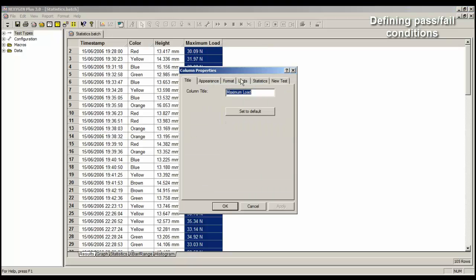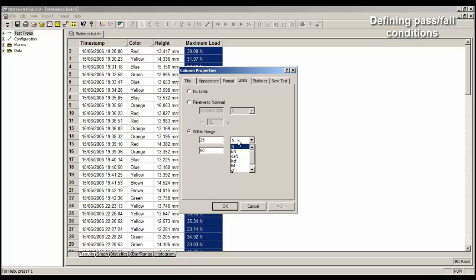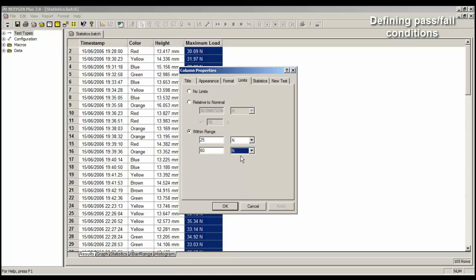We will now select Limits, and then select Within Range. Now I want to define a pass as being any value between a minimum of 25 newtons and a maximum of 60 newtons. So here I can enter 25 newtons and 60 newtons. And when I click on the OK button, the program reads the data, and will then colour the rows either red for a failure, or green for a good test.